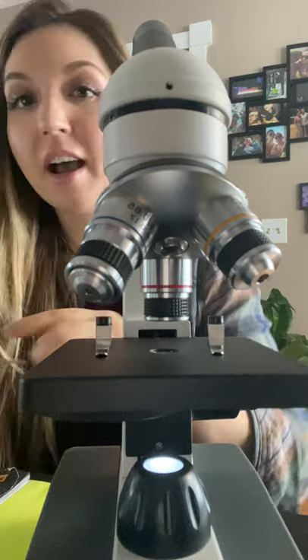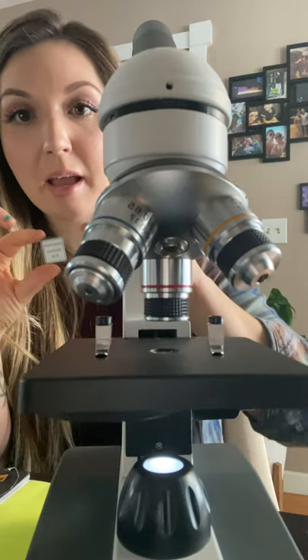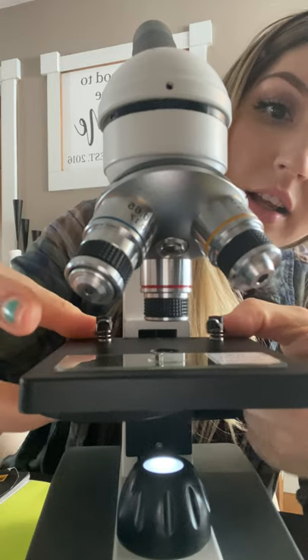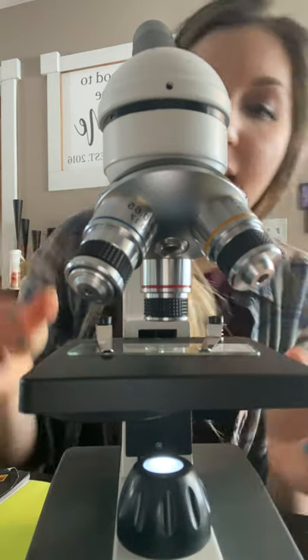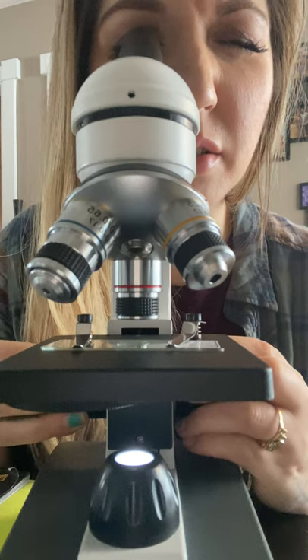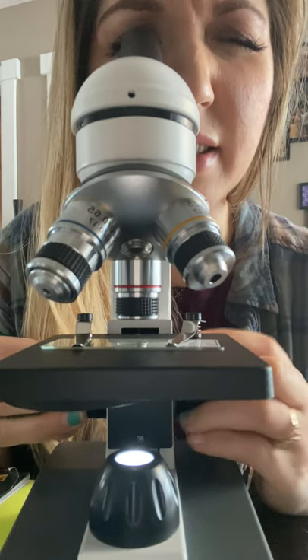Now I'm going to demonstrate how to place a slide. This is an onion cell epidermis slide. We're going to start by putting it right here on the mechanical stage, lifting up these little levers and placing it down. We're starting on our 40 times magnification and I'm going to use the coarse adjustment knob to get it into focus. There we go.